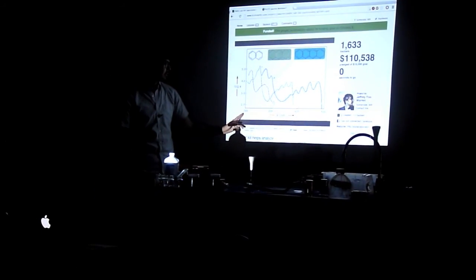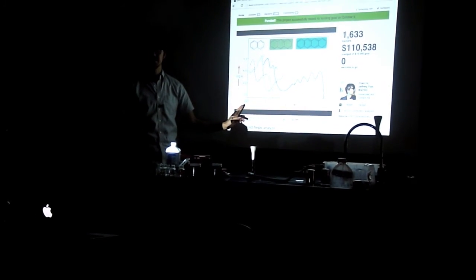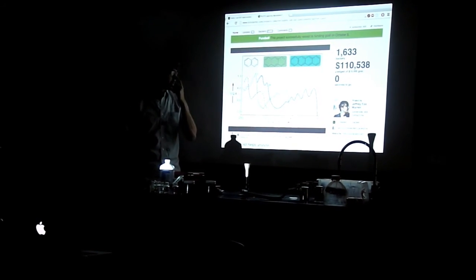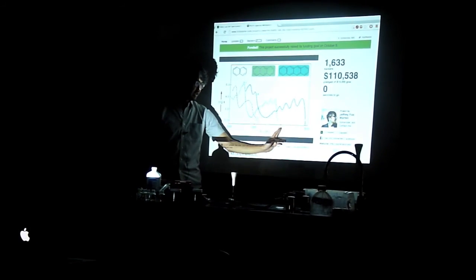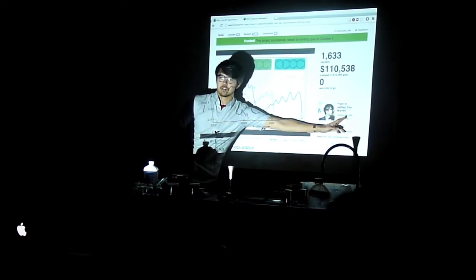And this is nanometer range. This is a spectrum that was published. I illegally copied it from the internet. And that's a measure of the color. So this is exactly right. This is actually blue, that's kind of green, and red is over here somewhere.